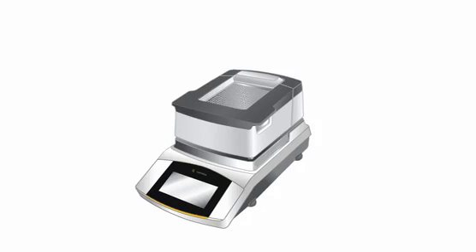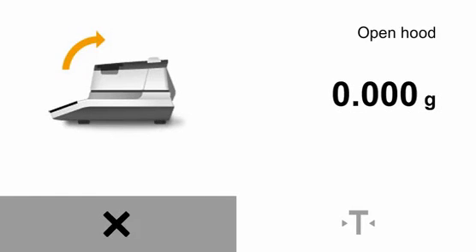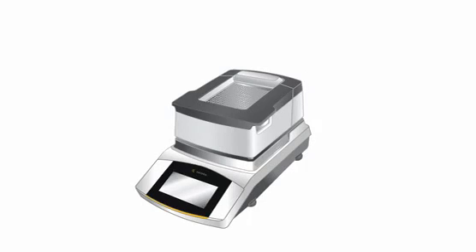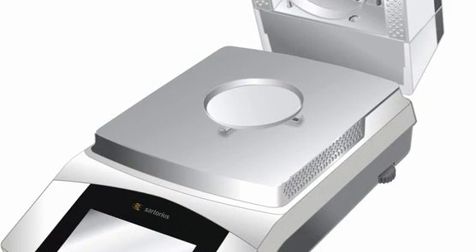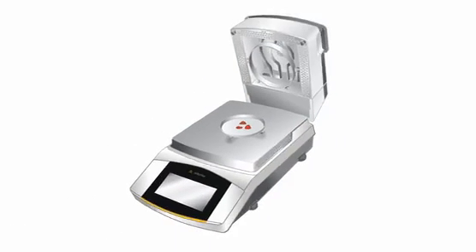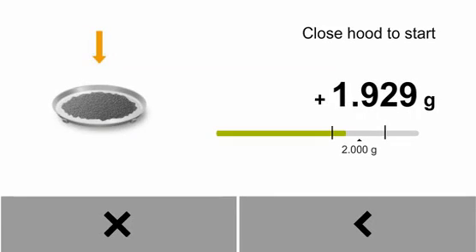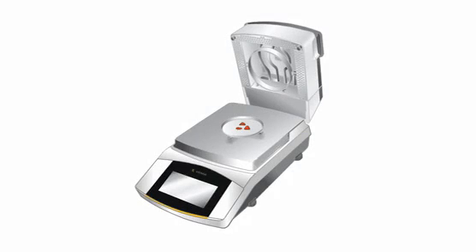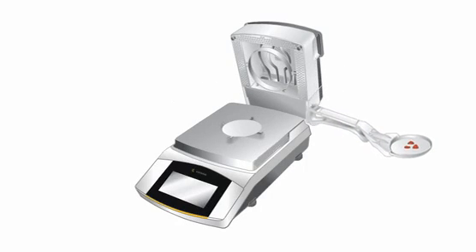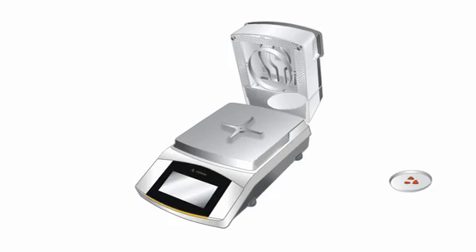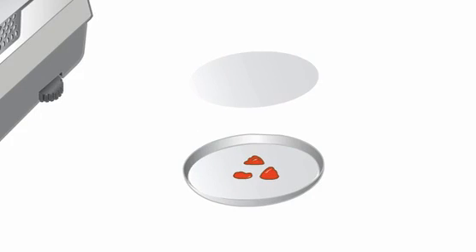Filling in a sample. Please open the hood and apply the sample until the target value has reached the green area. Remove the sample pan and place it on your work surface. Now take the lower filter and lay it on top of the pasty sample. Press the filter until the sample is evenly distributed.